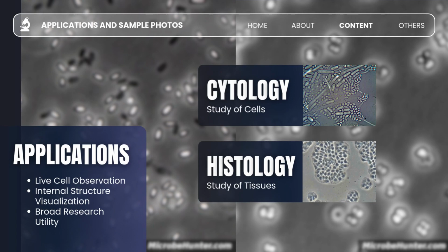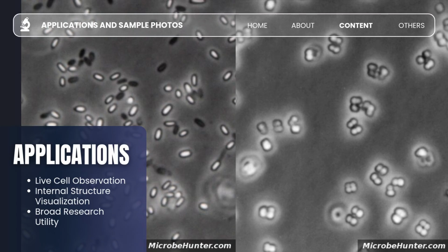cells, tissues, and microorganisms. Internal components such as cell membranes, nuclei, mitochondria, mitotic apparatus, and cytoplasmic granules all become clearly visible using this microscopy technique. Beyond that, phase contrast is also widely used in hematology, virology, bacteriology, parasitology, paleontology, and even marine biology.